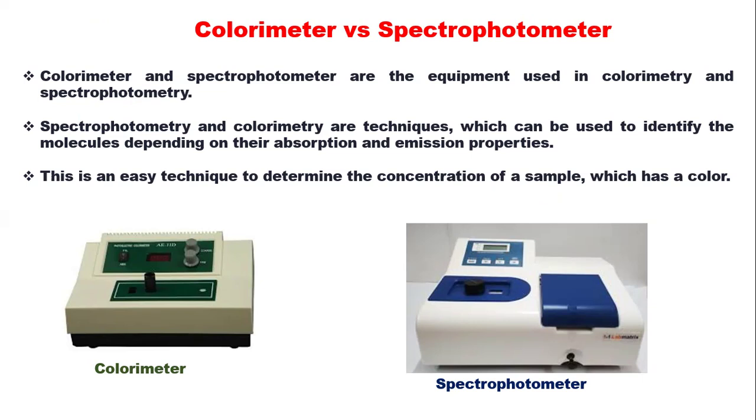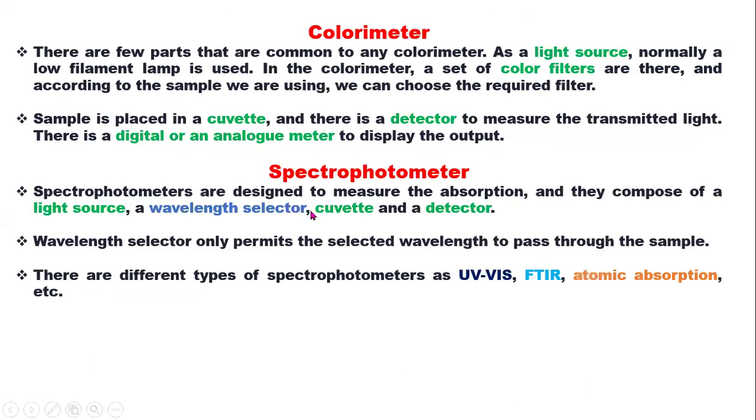We will see examples, because in these practicals, all through, they are linked together. After this, the next practical is on the preparation and uses of a standard curve, and before that you will do absorption spectrum. It's easier to understand absorption spectrum if you really understand spectrophotometry and colorimetry. So this is a colorimeter and this is a spectrophotometer. They have differences, but we are going to look at the colorimeter first. Then we'll talk about the spectrophotometer briefly. Then we'll look at their differences.